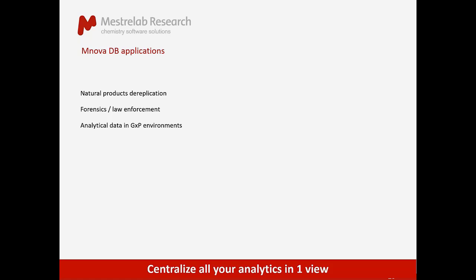The database is also a great way of making your NMR, LCMS, GCMS, or optical spectroscopy environment GXP compliant, because it allows you to achieve many of the things that GXP inspectors are expecting. Things like, for example, the data once it is saved to the database, it cannot be modified.